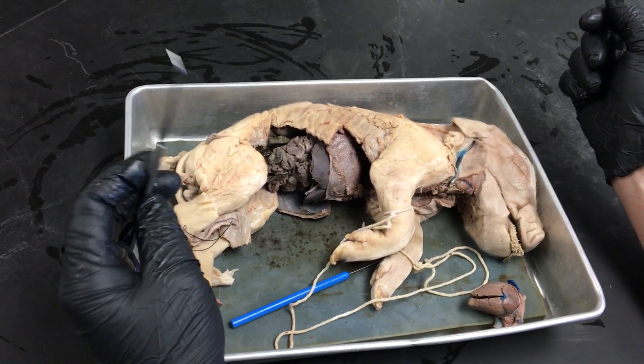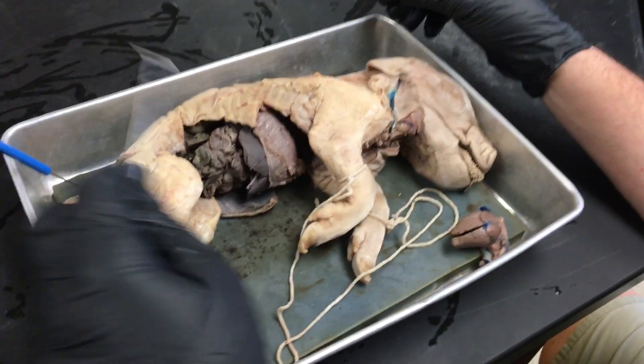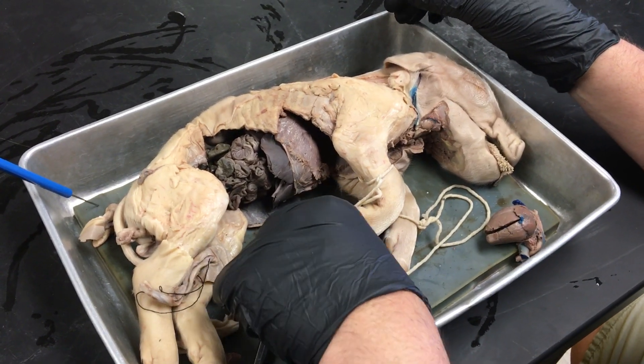Here we have a fetal pig dissection. This is a male pig and we'll be going over the anatomy as it pertains to Bio 182 Zoology here at Golden West College.